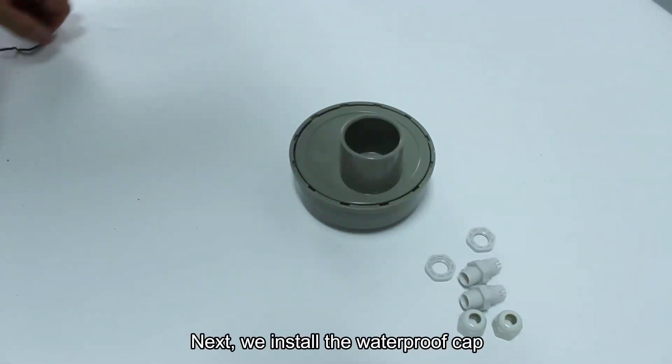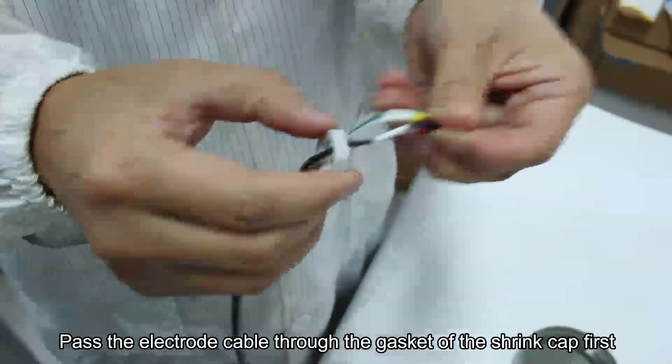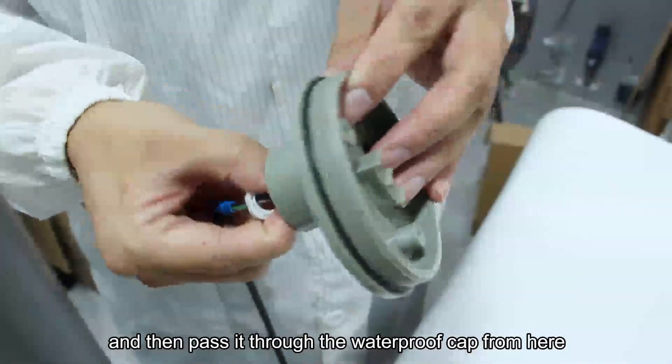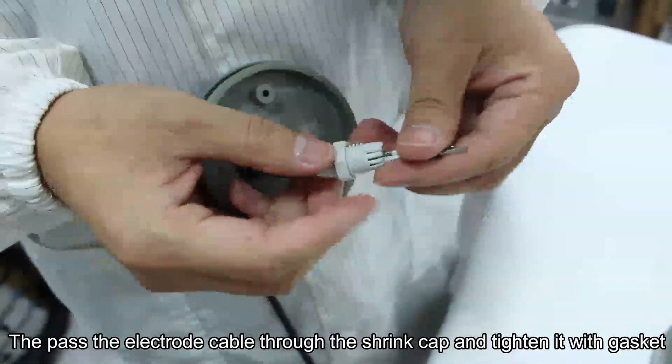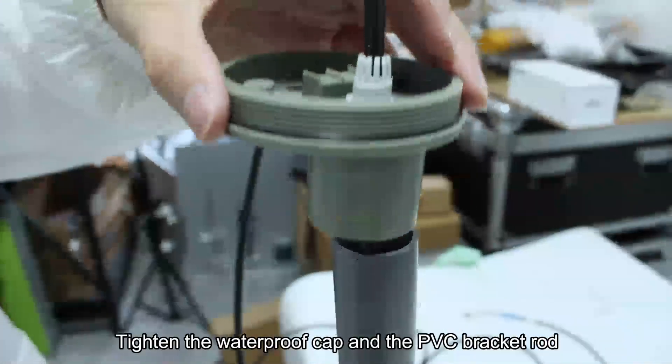Next, we install the waterproof cap. First, unscrew the waterproof cap. Pass the electrode cable through the gasket of the shrink cap first, and then pass it through the waterproof cap. Then pass the electrode cable through the shrink cap and tighten it with gasket. Tighten the waterproof cap and the PVC bracket rod.